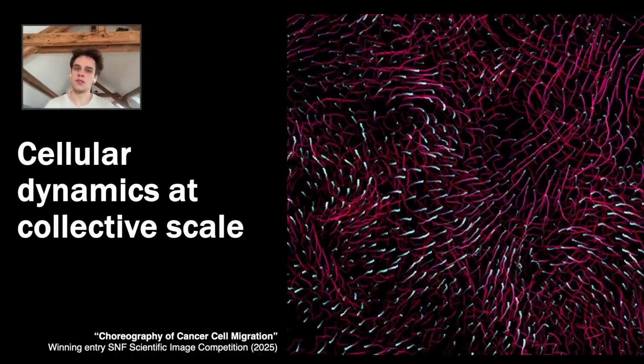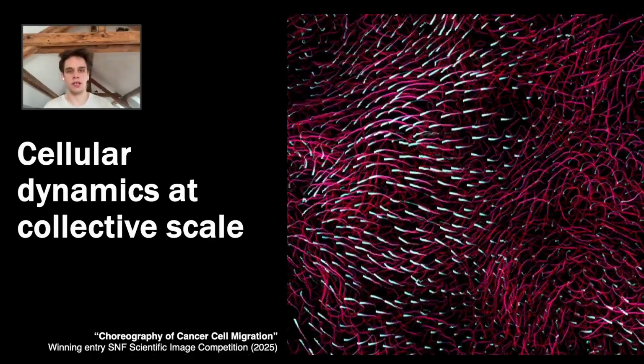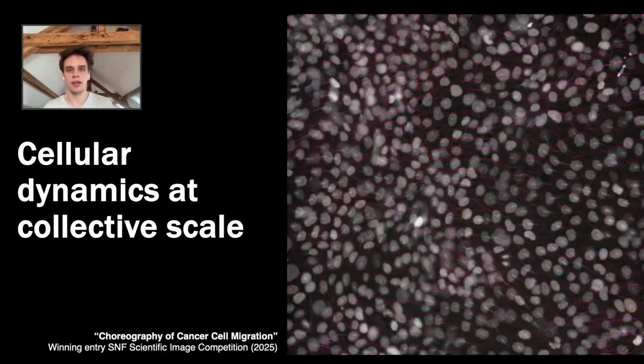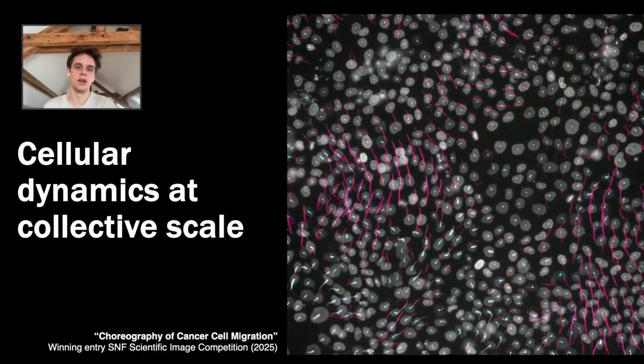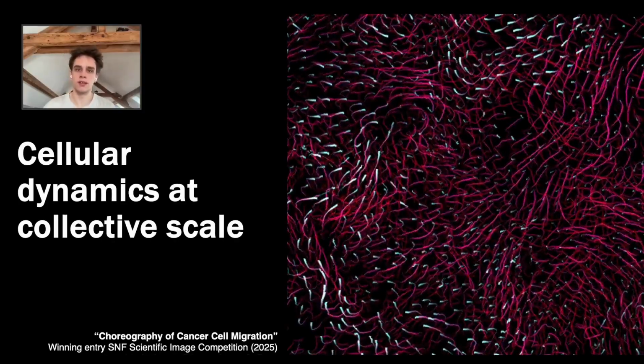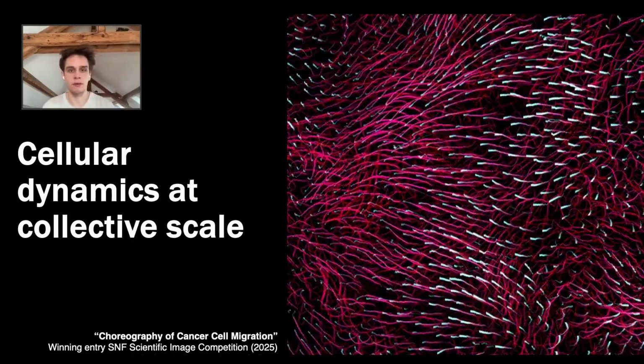How do these cells talk with each other? What are the collective dynamics? Here you can see them beautifully moving together like a flock of birds in the sky. So we're interested in how these dynamics relate to cellular fates like survival or cell death.